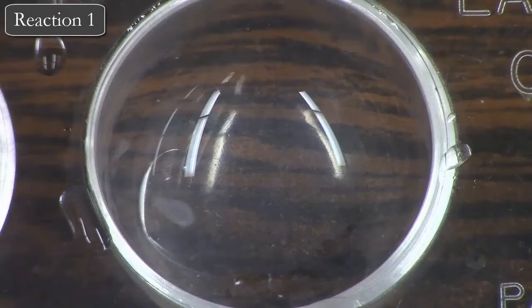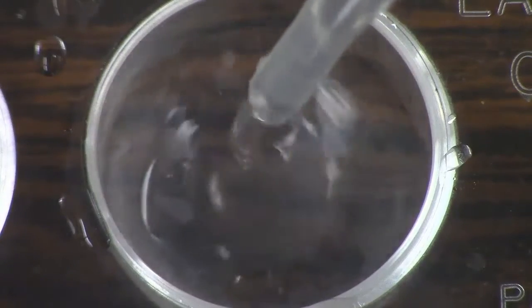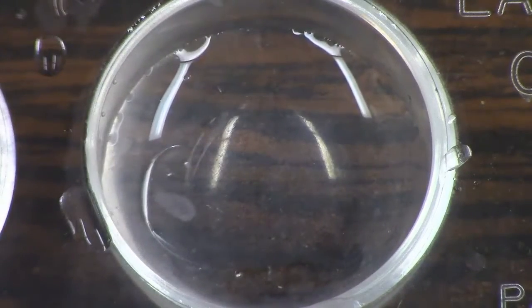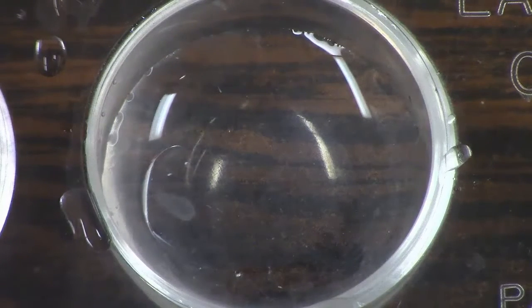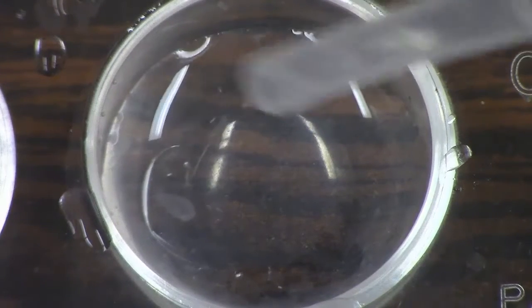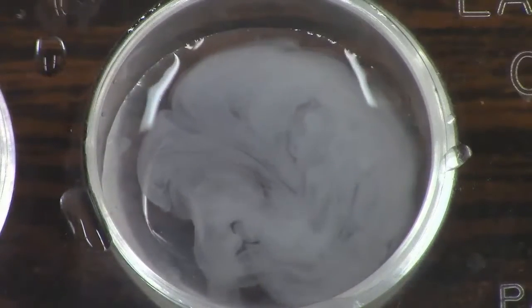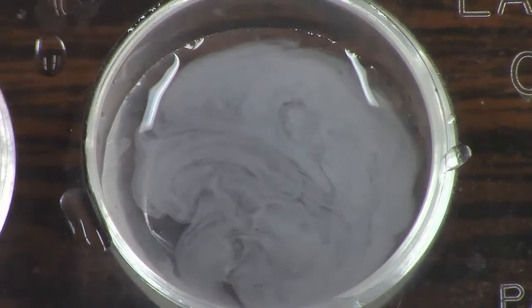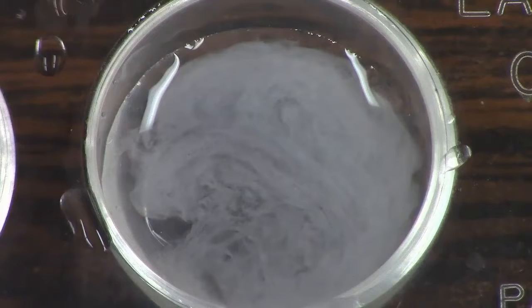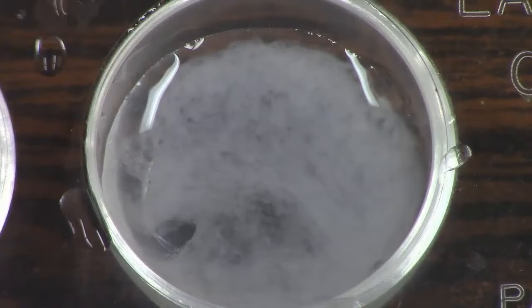So in our first reaction, we are going to be taking some barium chloride solution, and then to that, we are going to be adding a few drops of sodium sulfate solution. So pay attention to what happens when those two solutions are mixed. Remember what it means for there to be a physical or a chemical change. Think about that.